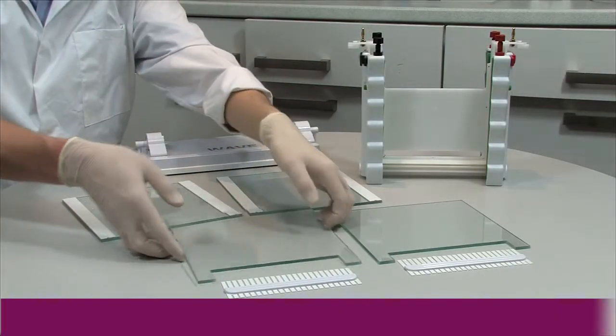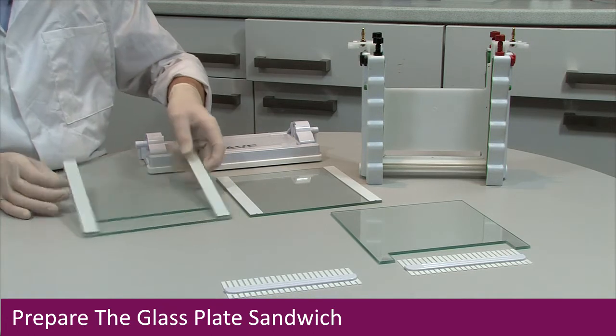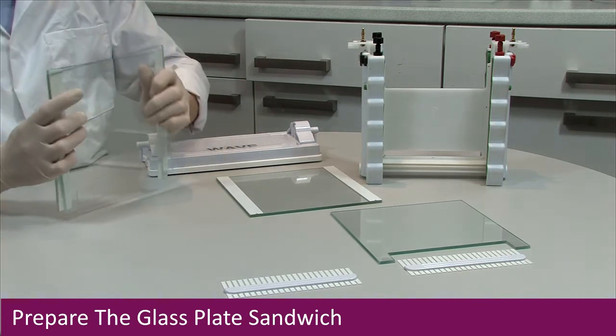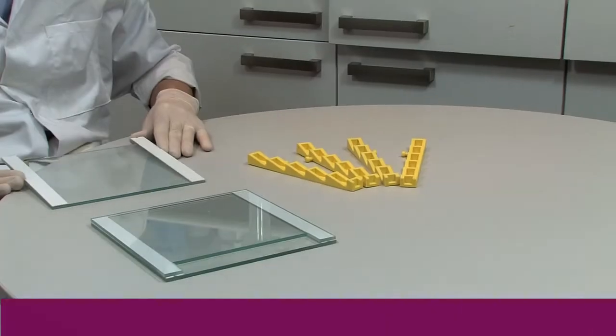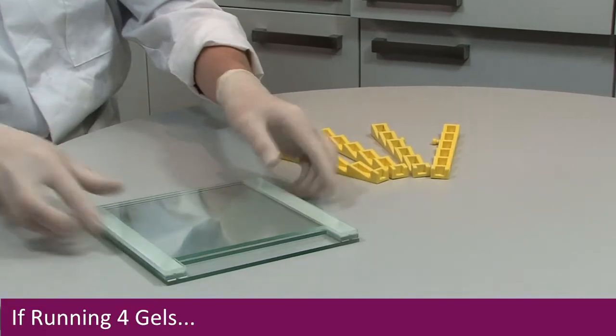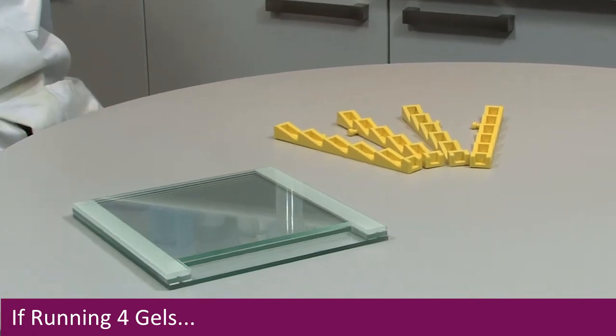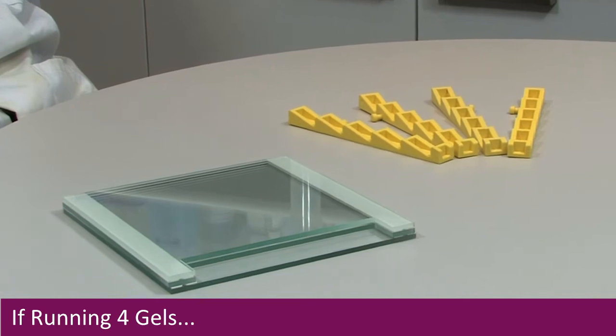Ensure that all components are clean, dry and free of any chips or cracks before making a glass plate sandwich. If running four gels instead of two, position a notched glass plate with bonded spacers over the single gel sandwich. Also use the thinner yellow clamps in the casting upstand.